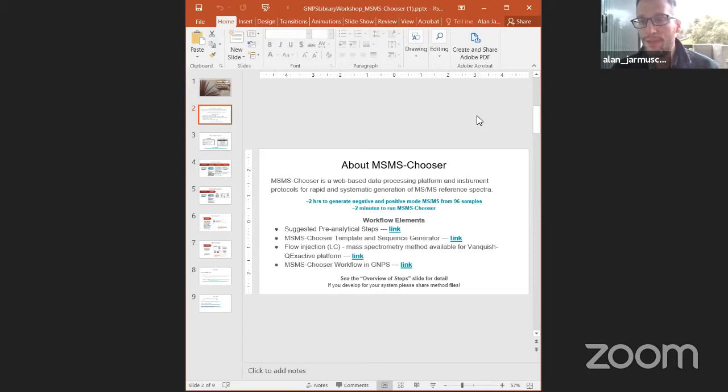The analog version of this would be opening up every file and looking for the scan number, and I've seen a couple of comments in the chat about how to even do that. This alleviates those headaches, because using a standard template, the software looks for the chemical and its MSMS for you.